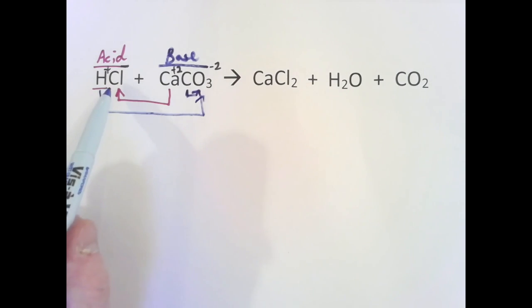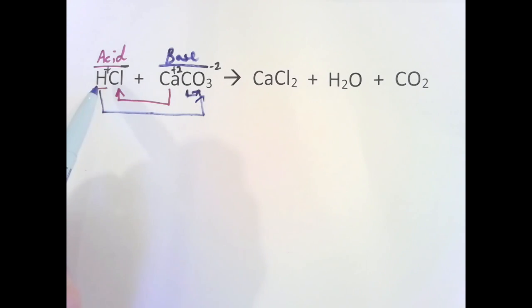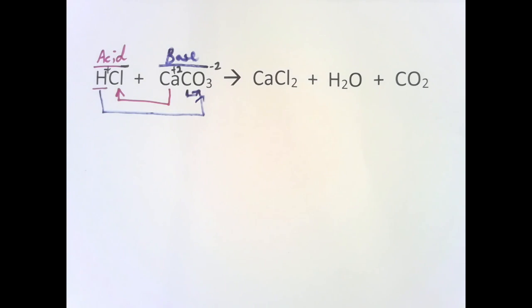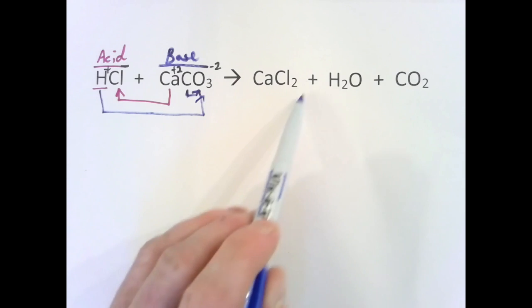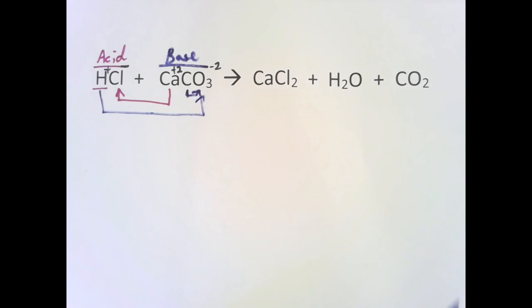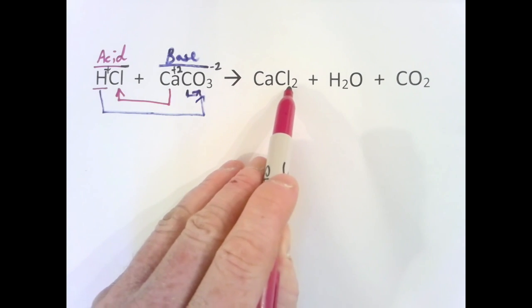So we've taken hydrochloric acid and broken down the calcium from it. After the hydrogen ion is released, it goes into making water. And what we're left with is calcium chloride, water, and then of course the gas that was released in the reaction, the CO2.